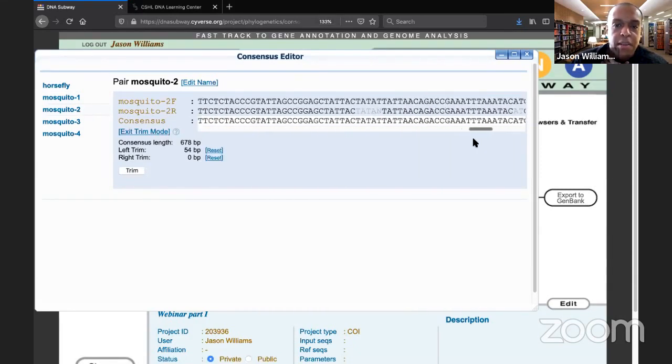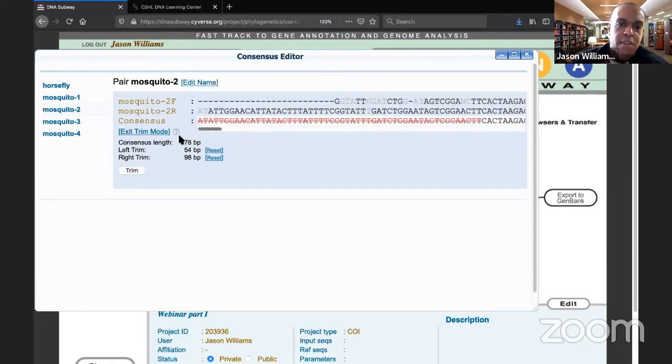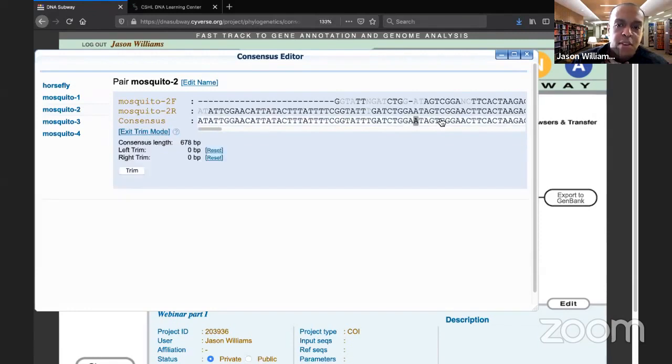Let's go here. There's another batch of Ns. And if you notice, somewhere on the right-hand side between 70 and 90 is what I'm looking at when I'm trimming on the front end. It's the first 50 or so. Whoops, I didn't actually trim that. Let's go back and do it.